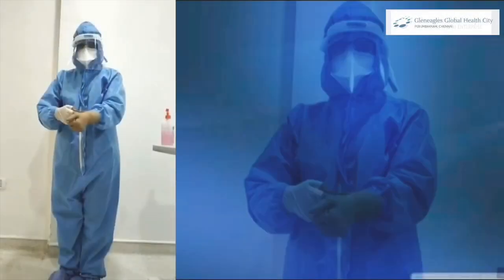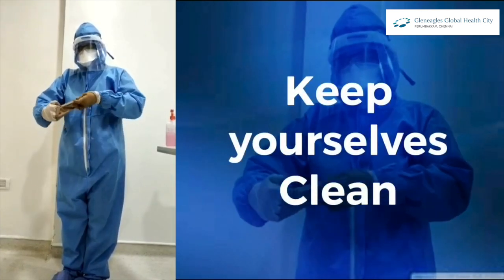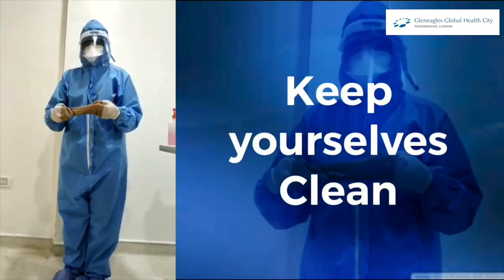The most important and crucial part is doffing. The key point is to keep yourself as clean as possible when doffing.